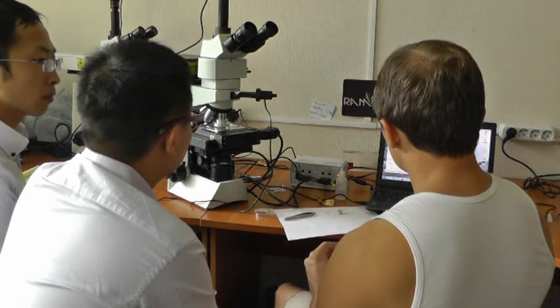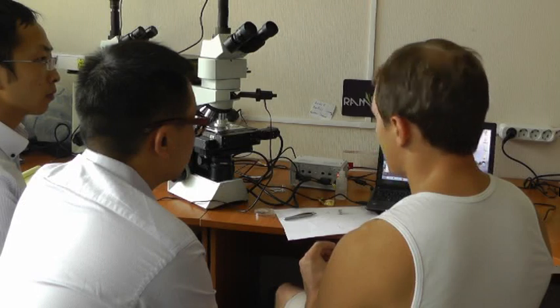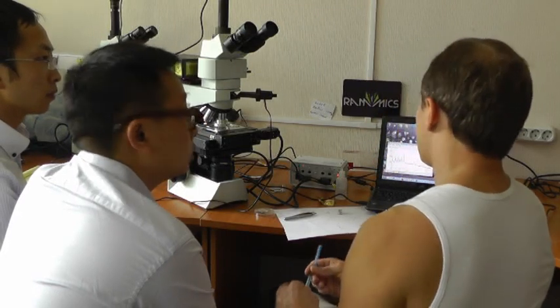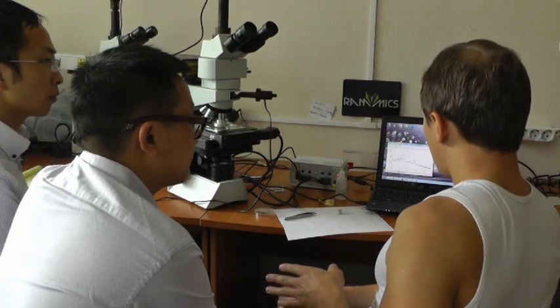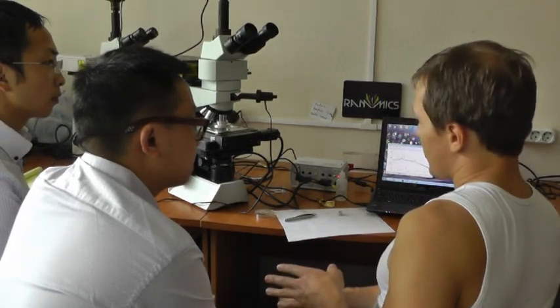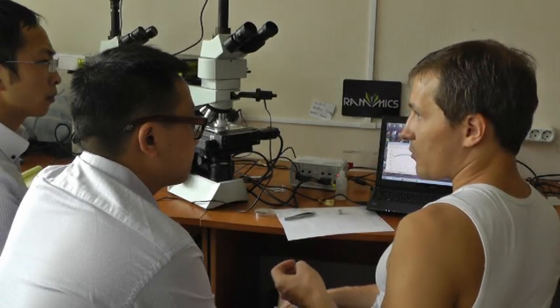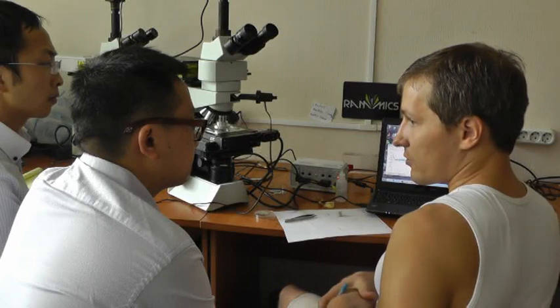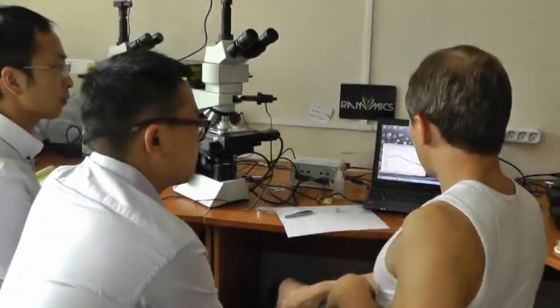What if there happens to be two components in one spectrum? Normally, if two components are 50 by 50%, the result of recognition will be less than the recognition threshold, because none of them will exceed the threshold value, and this spectrum will be thrown away.